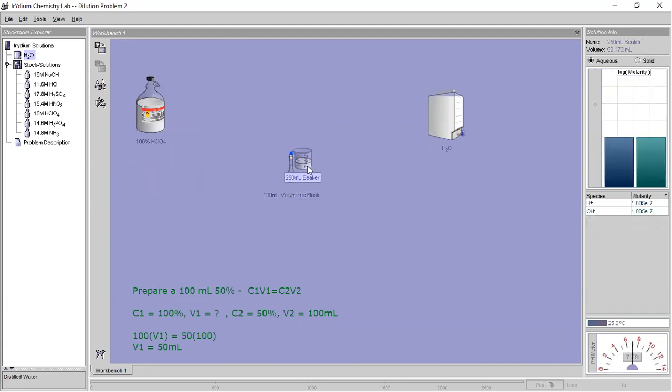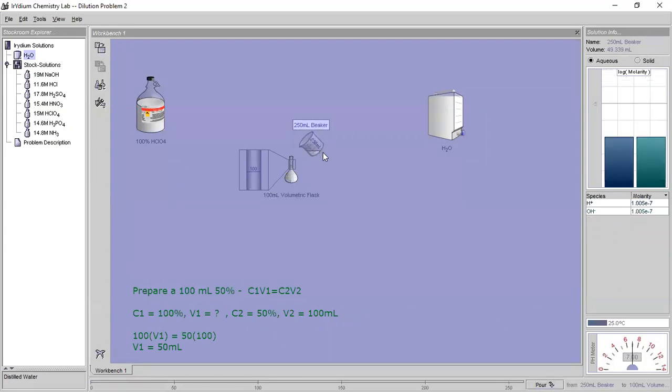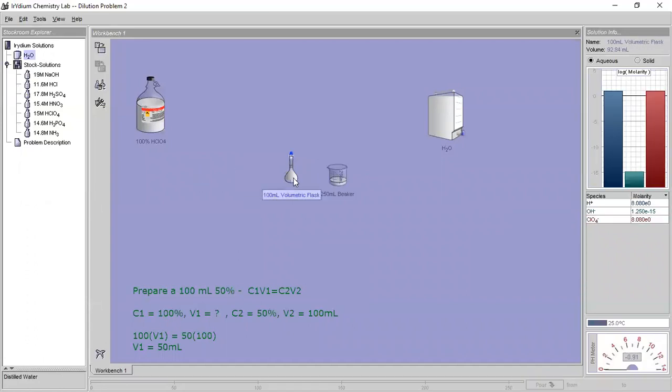So now we're going to add the water to the volumetric flask. Again, you see here in the insert, we want to get right at this calibration mark. Now here, if you go over, you have to start over because you've messed up the dilution. So it's very important that you don't go over at this point. Again, we're going to add it with the beaker as close to 50 as we can. And then next we're going to get a pipette. So right now we have 92.8. And if you try to use the beaker again, you may get lucky.